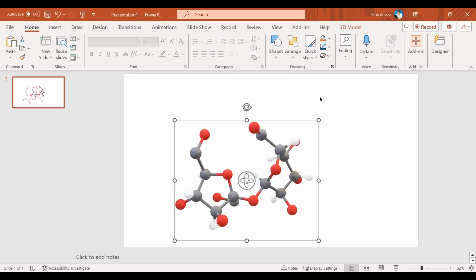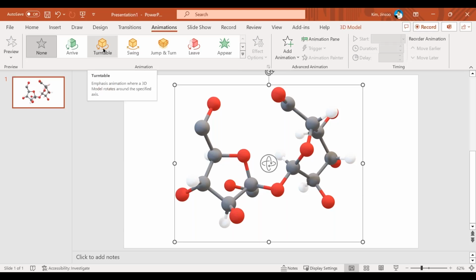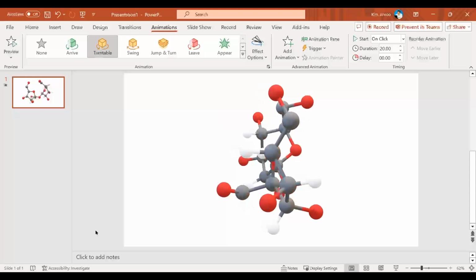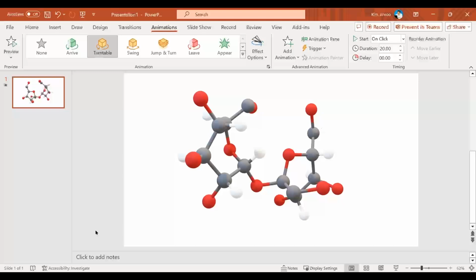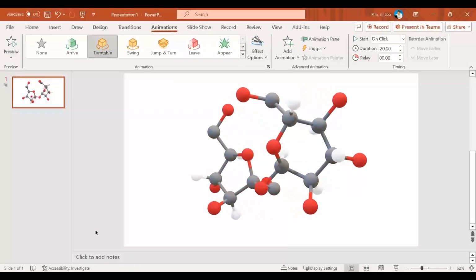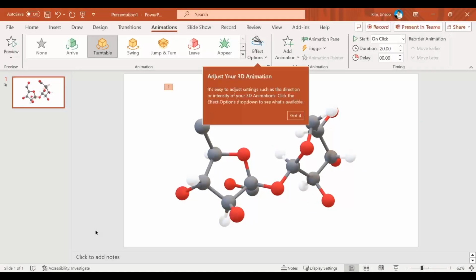So I say, oh, I'd like to present this to people in some kind of research meeting. I can apply an interesting animation. Let's turntable. There we go. And so you have this really nice way of presenting content to folks, for whatever purposes, whether it be a research presentation or a seminar or whatever. But it just is a really powerful way to take advantage of a molecular language so that you can go ahead and represent those things very easily, because obviously drawing this thing manually would have been very challenging. And you can just leverage a lot of the tools that are built into ChemDraw to help you do these things.